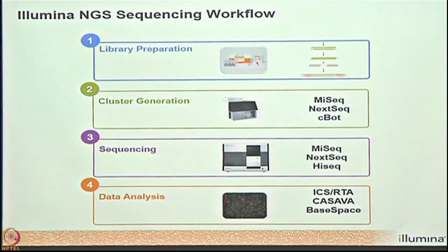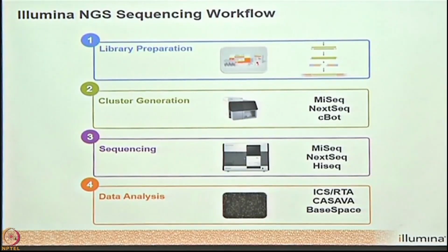I'll be covering all the parts one by one. The very first step involved in all the sequencers is library preparation, which is followed by cluster generation. Then comes the sequencing, and the final step is the data analysis part. So first is the library preparation. It's common for all the platforms. Though the sequencers are different, the concept remains the same.